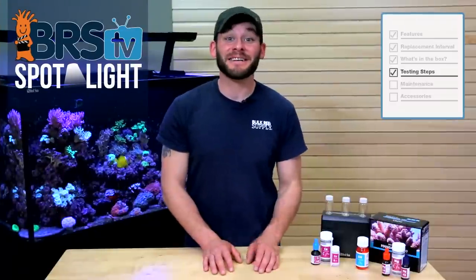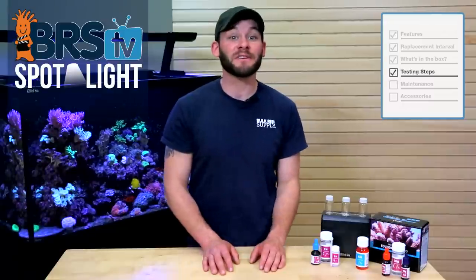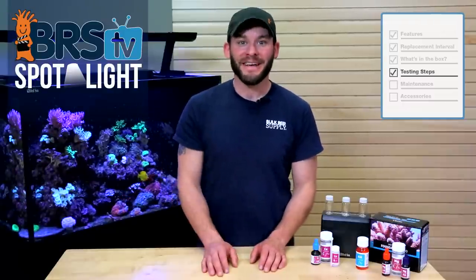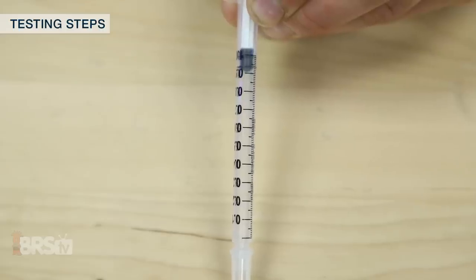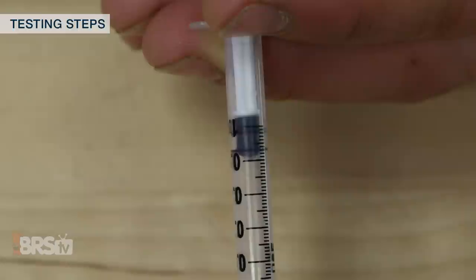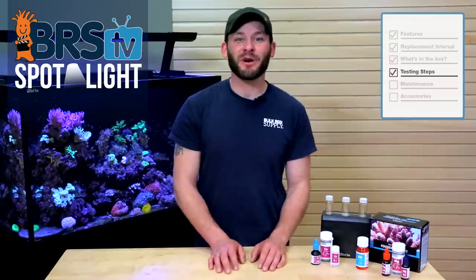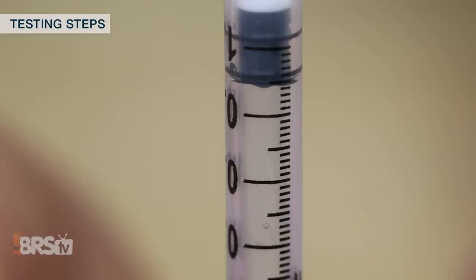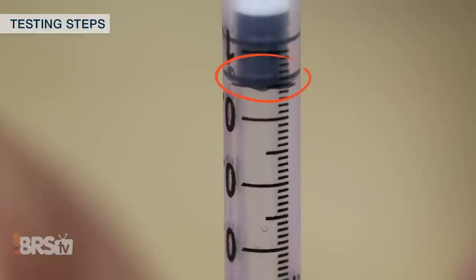Before we get into the steps to conduct the alkalinity, calcium, and magnesium tests, let's briefly go over some things to do prior to starting them. First, how to read the plunger inside the syringe: follow the bottom seal of the plunger itself and forget about anything else happening within the syringe. Anytime you draw liquid or read the end result, simply pay attention to the bottom of the plunger ring where it makes a seal with the syringe, and you'll get the reading right every time.